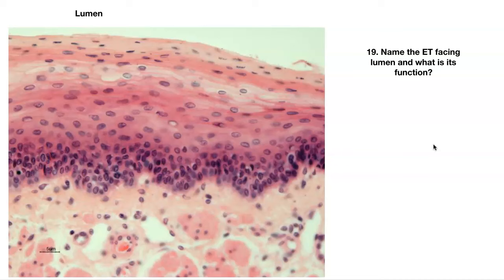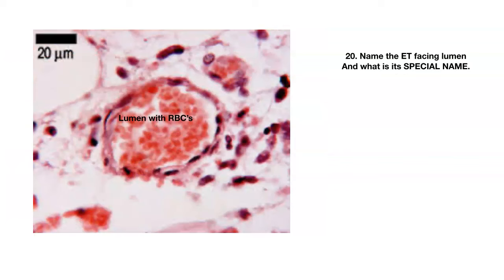Number twenty. This is kind of a blurry slide — I wish I was in the classroom to get a better picture — but name the epithelial tissue facing the lumen. Here I'm showing you a lumen that's filled with red blood cells. Name that type of epithelial tissue facing this lumen and what's its special name that we give it?